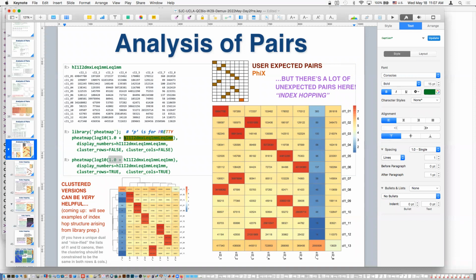Log 10 scale is always a problem because you got zeros, right? Which are theoretically possible. So we could color those a special color or something. We'll just do something very easy. I mean, the numbers are mostly in millions, tens of thousands. We'll just do log 10 of 1 plus, right? The easy way, we'll just shift it a little bit relative to scale. That's not too much, but it would solve the zero problem. Anyway, I don't really want to spend time saying we're not treating zeros completely right, but whatever, it doesn't really matter for this case.